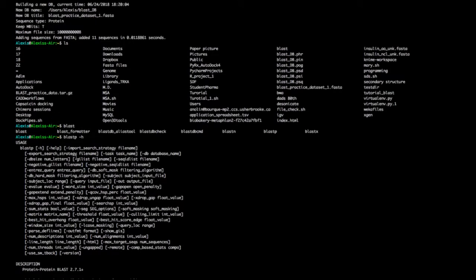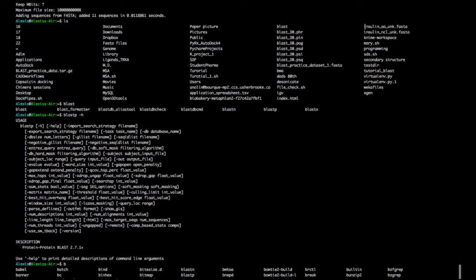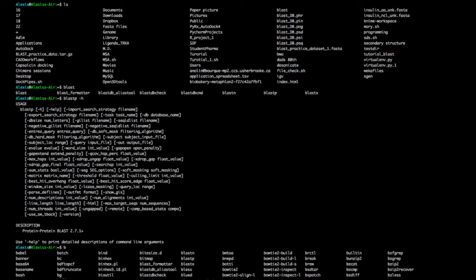We'll run blastp. You can give a name to your task — relevant if running on a server, but not critical now. Our database is BLAST_DB. For the query, we'll use the amino acid unknown file: insulin_AAA_unknown.fasta. The output file will be called 'aligned.txt'.